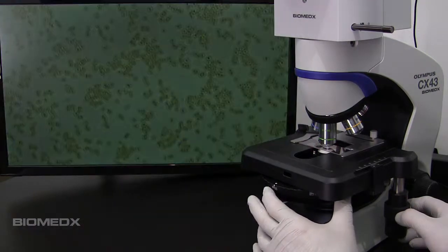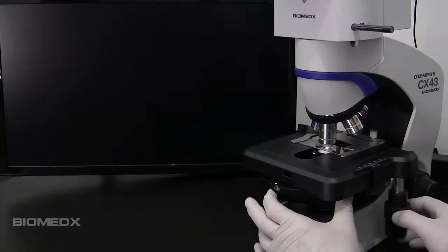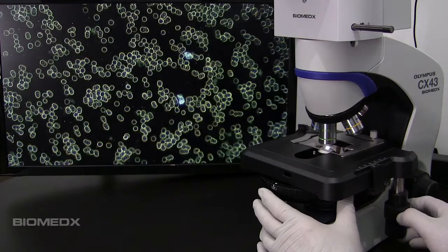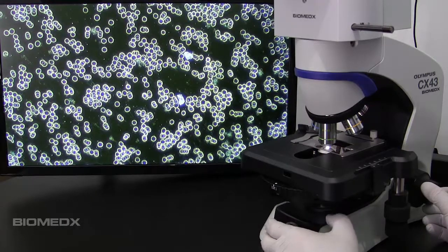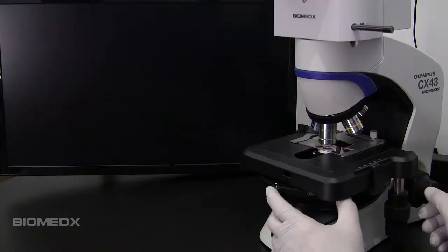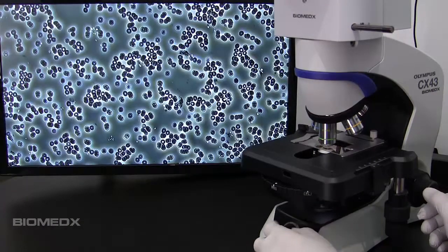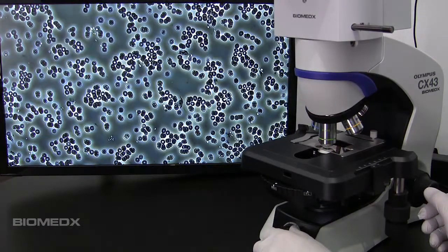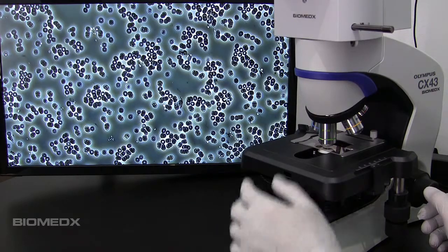I thought that having you look at the monitor and the scope like this and going through the modes would be the best way to demonstrate the tremendous versatility of this unit and the ease of use. One drawback however is you are watching a video of a video so you are not quite seeing the nuance and image that you would see if you were right in the room viewing it live directly.